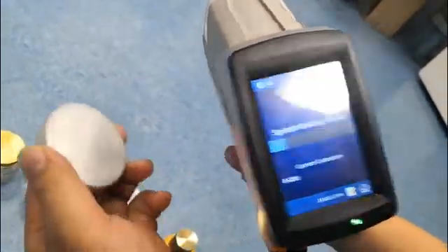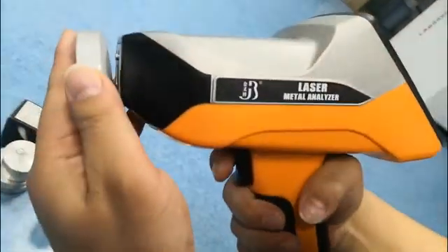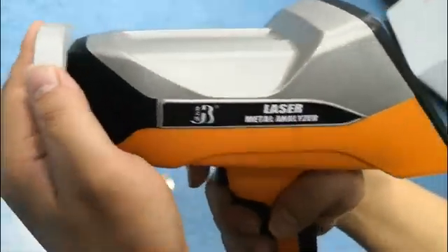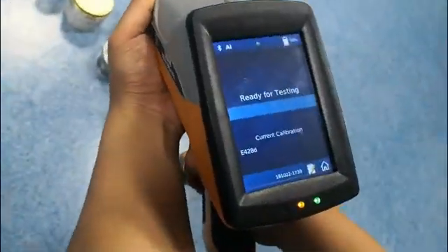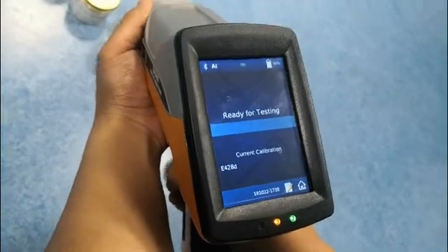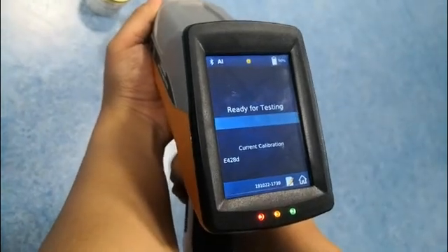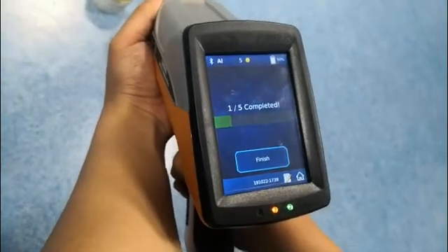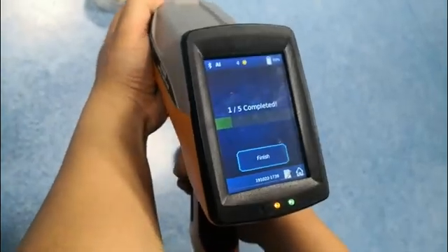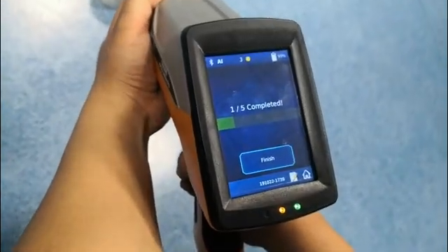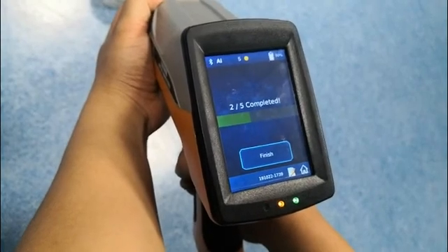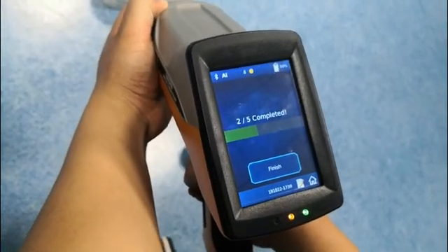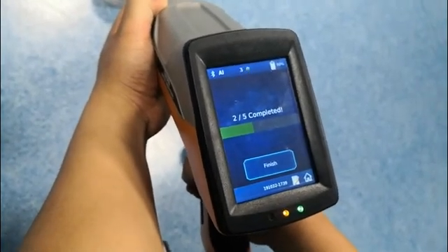Testing. One time, two time, three time.